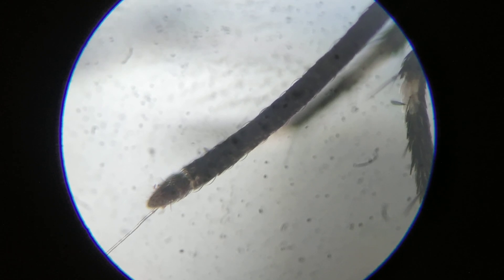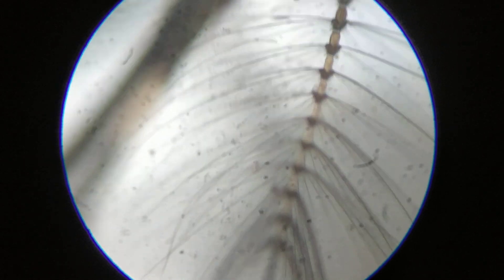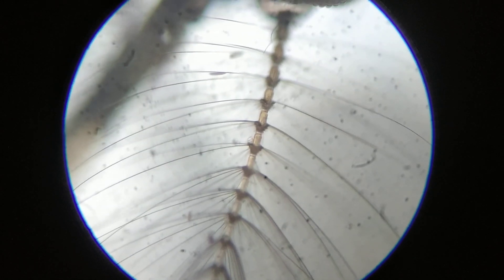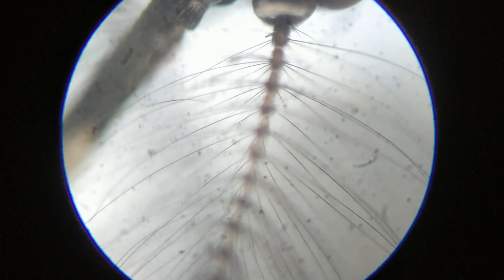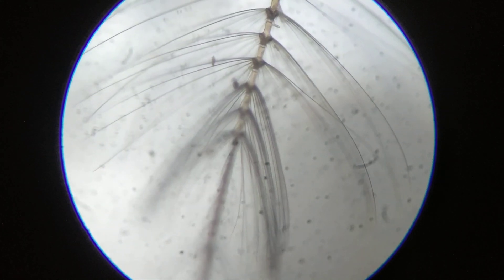This was also shown in one of my earlier videos as well. These are the accessory mouth parts which it uses, something like a feather as you can see over here. These are the feelers that it uses to sense the presence of the probable host from which it sucks blood.